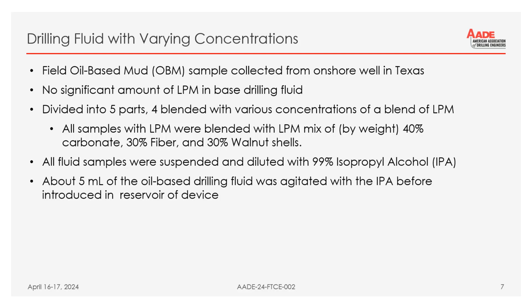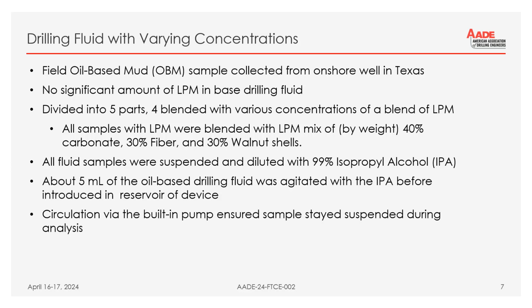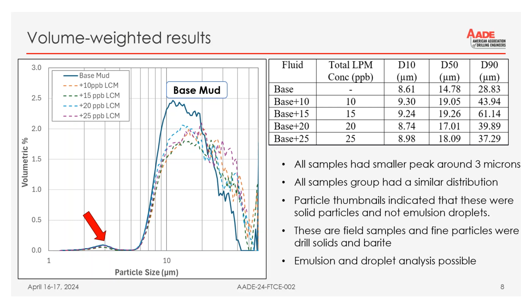So again, we took the sample, mixed it well to dilute it a bit, took about 5 mLs and introduced it into a recirculating system. Most of these particle size analyzers have recirculating systems to make sure that representative sampling is done. Not all, but most. So when we look at the results of a laser diffraction system, you can see that there are some differences.